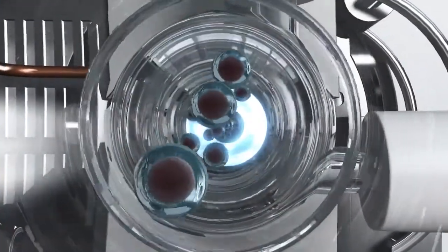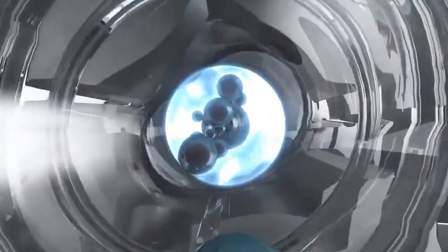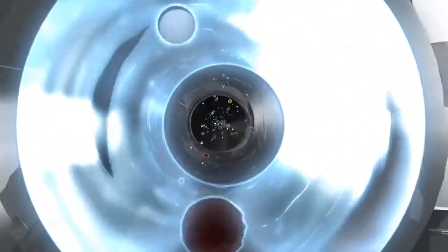From the spray chamber transfer tube, the small aerosol droplets are carried to the plasma torch, which features a 2.5 mm wide injector to ensure the droplets are dried, decomposed, atomized and ionized effectively.